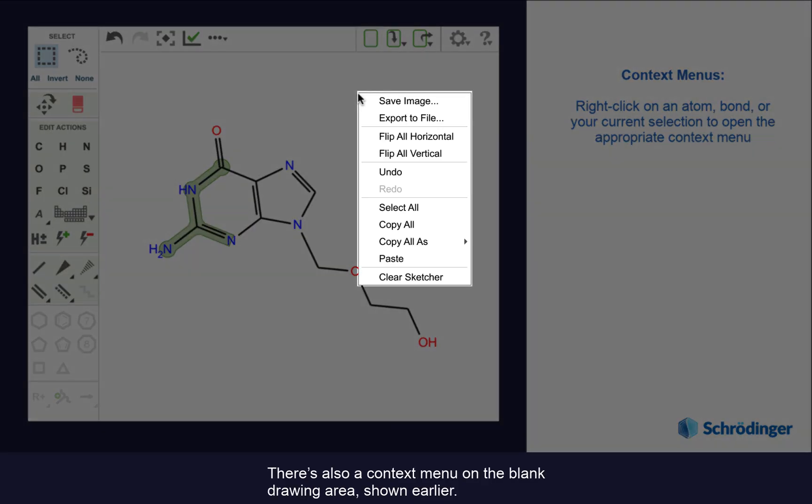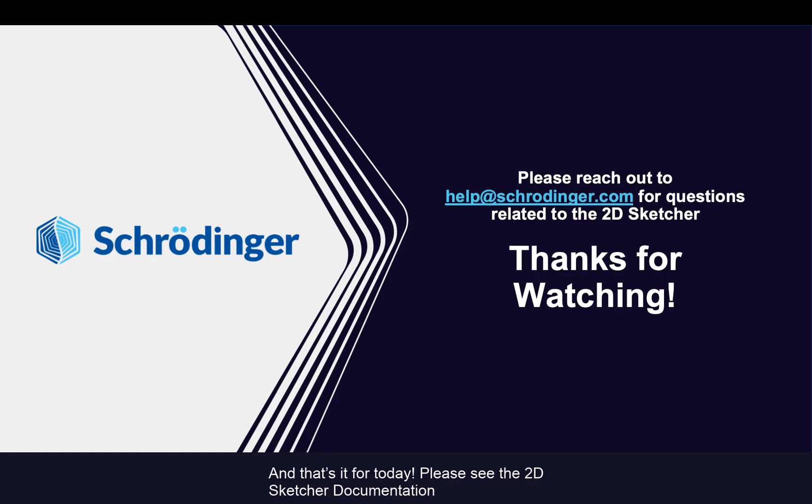There is also a context menu on the blank drawing area, shown earlier. And that's it for today. Please see the 2D sketcher documentation and quick reference sheet for more information.